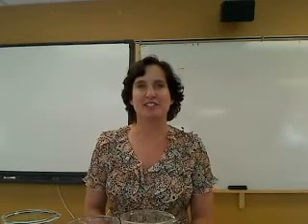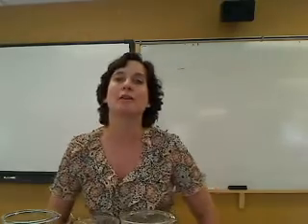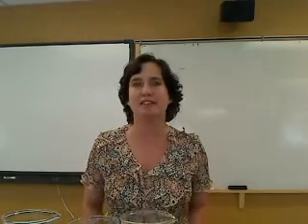Hello Chemistry. Today's lab is called Meltdown Madness. This is an open-ended lab where the student is going to design and conduct the experiment, one that hopefully is going to collect meaningful data. So what do we want to try to find out today?